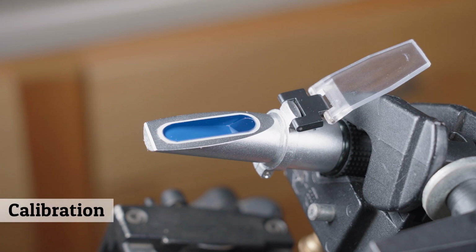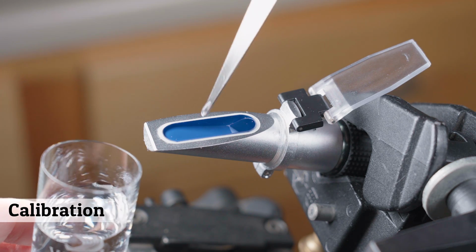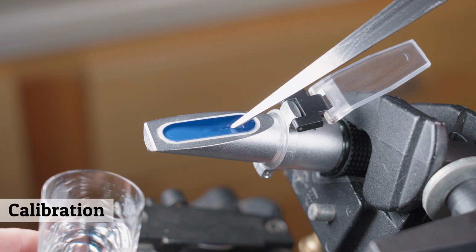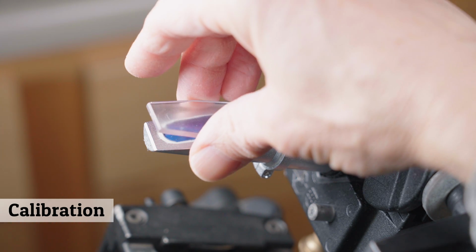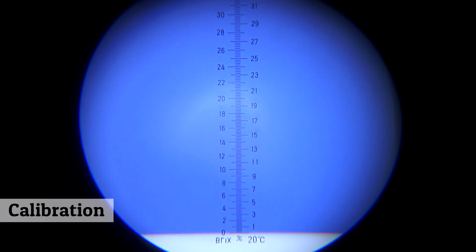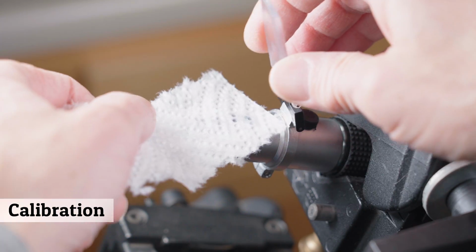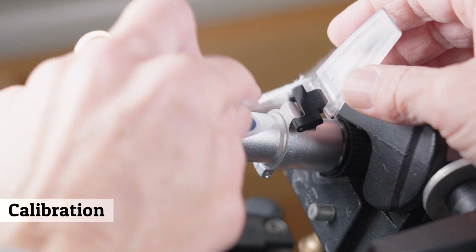Okay, next we'll start with checking the calibration of the refractometer, and I'm doing that with the distilled water. The recommended way is to put some distilled water on the platform, close the door, and then we'll see a line come up on the screen. You want that line to be even with the measurement line. So as you can see right here, it's in calibration. Luckily, this is a unit that I've had for many years, and I really never calibrate it, so it's held its calibration really well.